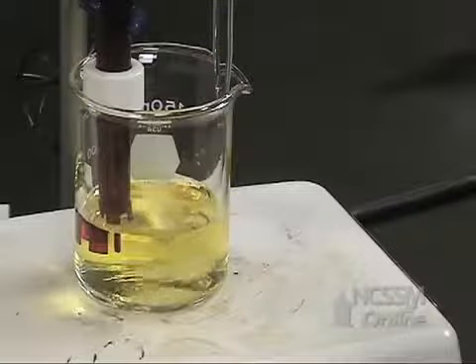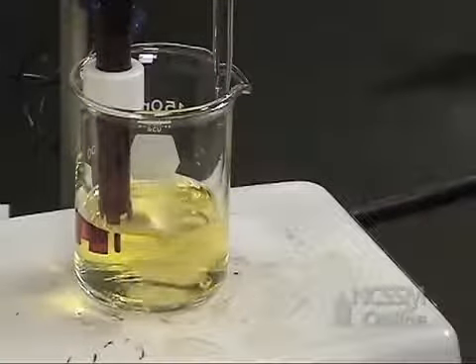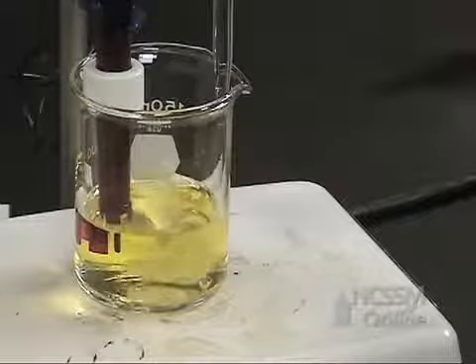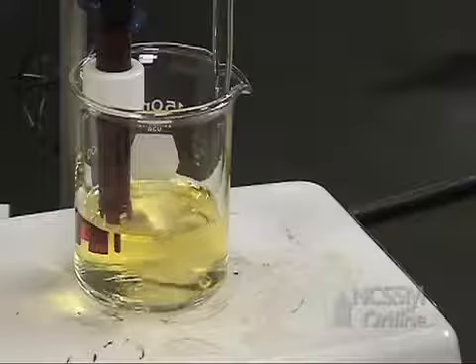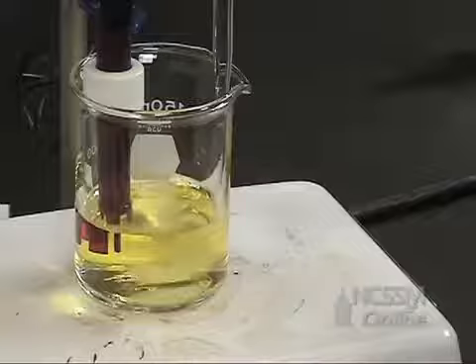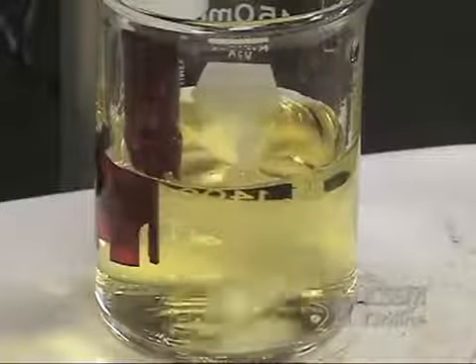You'll collect data every 2 milliliters up to 20 milliliters, every 1 milliliter from 20 milliliters to 30 milliliters, and every 5 milliliters from 30 milliliters to 50 milliliters. You also want to try and record the volume where the indicator changes from yellow to blue.